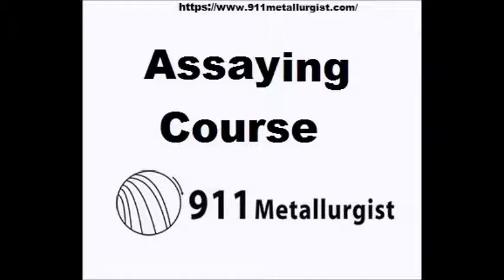Laboratory book. This is the assayer's notebook, in which he enters clearly the particulars of his work, the results obtained, as well as how these results were arrived at. The calculations should be done on scrap paper and should not be entered, although of course detail enough must be shown to enable the results to be recalculated.